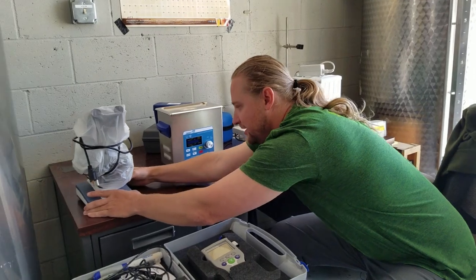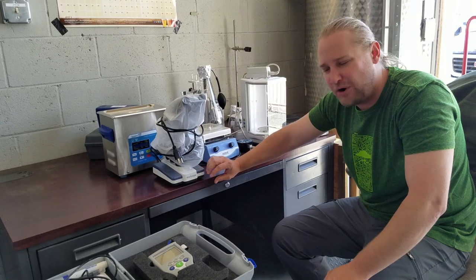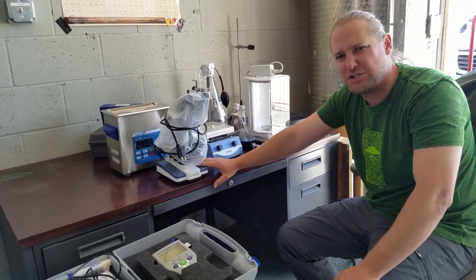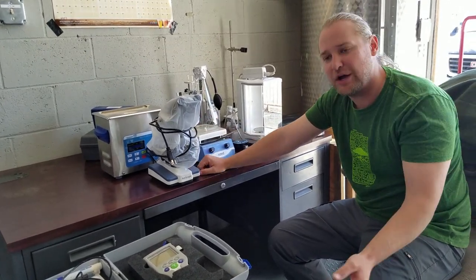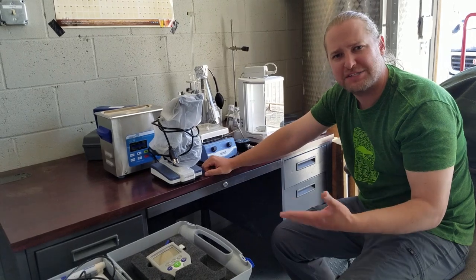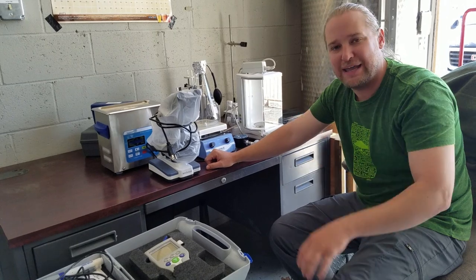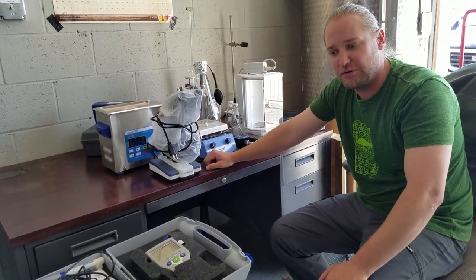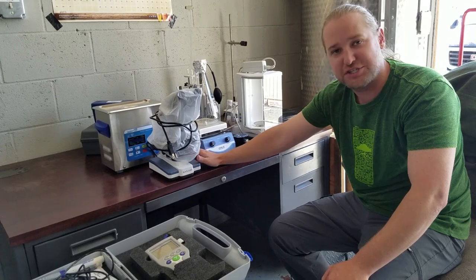After the ultrasonic cleaner, we have our AM Scope microscope — it's not an expensive one, probably two to three hundred bucks; I think it's the AM Scope B120B. It's kind of nice that throughout the last decade optics have gotten a lot cheaper and a lot better, whether that's microscopes, magnifying glasses, or gun scopes. Computers have improved manufacturing, and you can get a good microscope for pretty cheap these days.